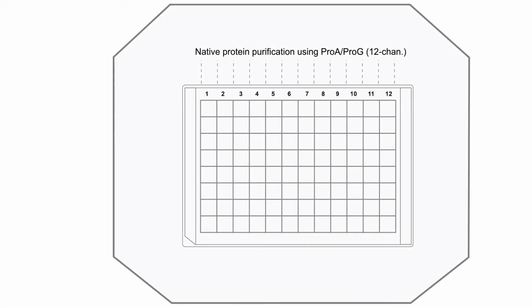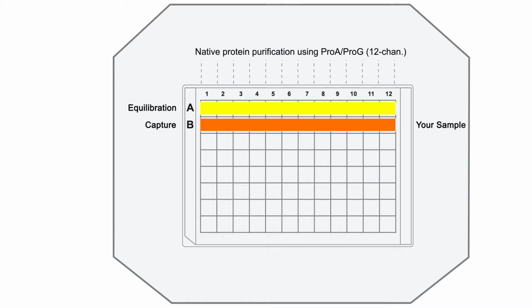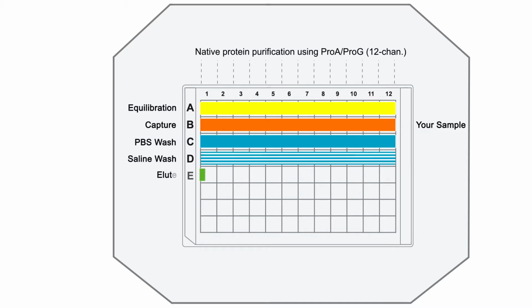The color track sheet is used for setting up your deep well plate. Equilibration row is for aliquoting equilibration buffer, which removes shipping buffer and conditions PhyTip columns for binding. Capture row is for aliquoting your sample. Wash buffer rows are used for different wash buffers, and elute row is used for elution.